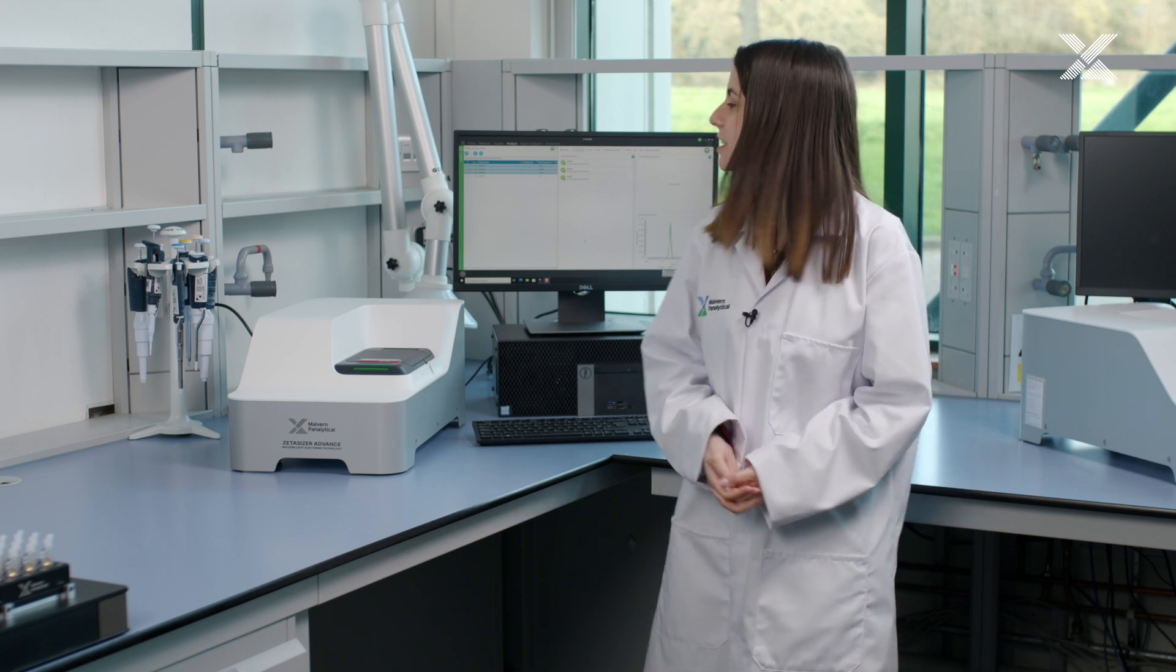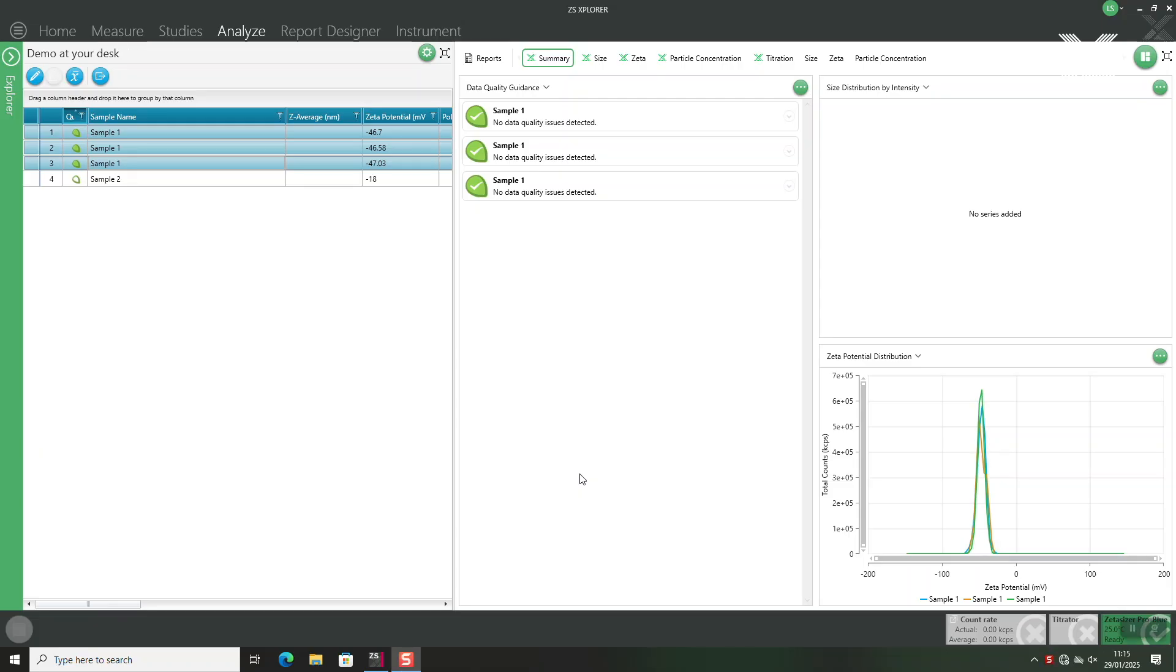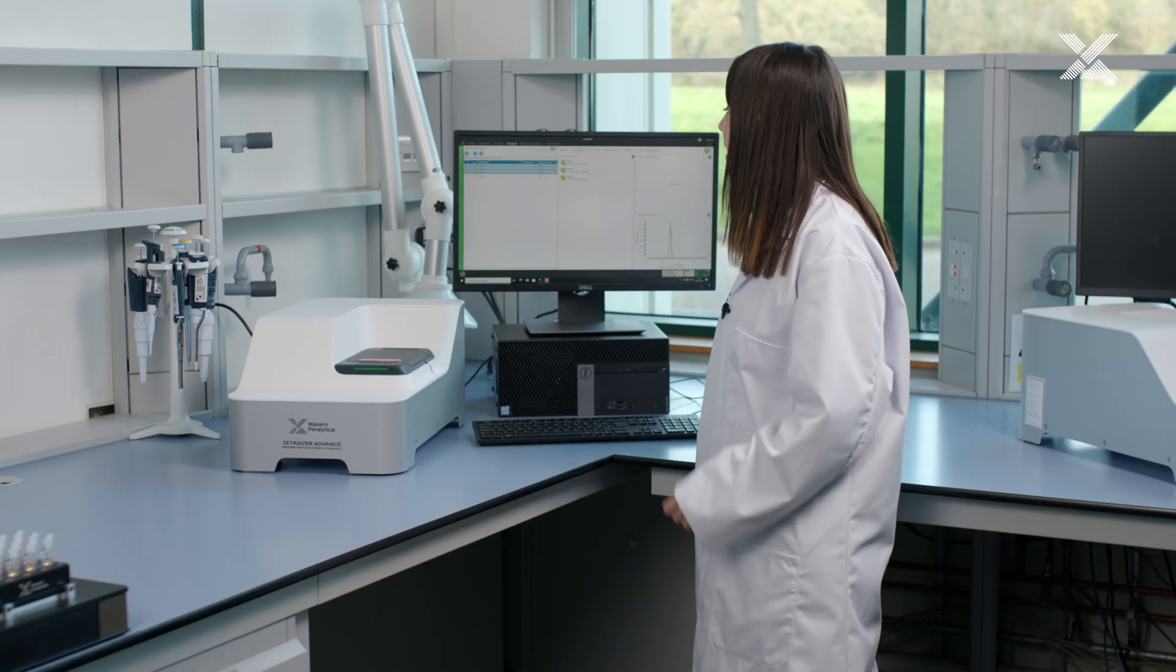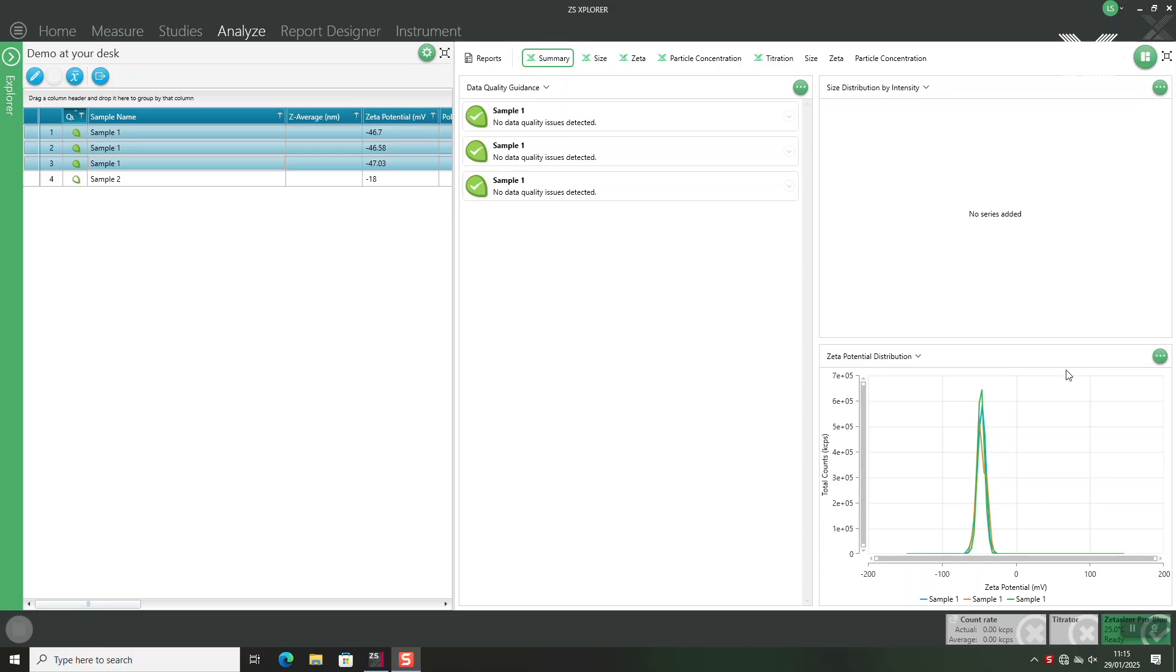When the measurement is completed we can go into the analyze page to view our results. So first of all we have our results overlaid and we can see the data quality guidance that says that there were no data quality issues detected and we can also see the zeta potential distribution.